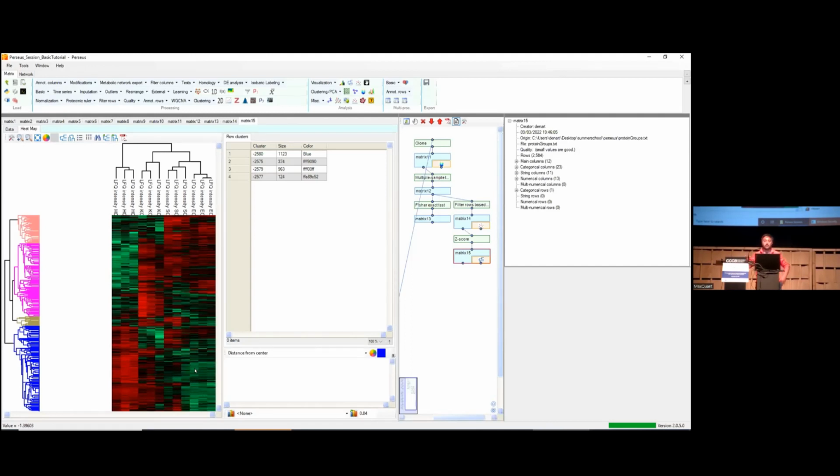If you didn't have the labels, let's say if you cover these labels here, you don't know which cell types you have, but you have the expression and the clustering, this will allow you to identify the cell type. So there is a correlation between the clusters done with the proteins and the cell types. And then this is up to a biologist or someone that really understands this data very well. What else can I see here if I vary the number of clusters? What I can see here is a way of identifying cell types based on protein expression, but you might see something different.